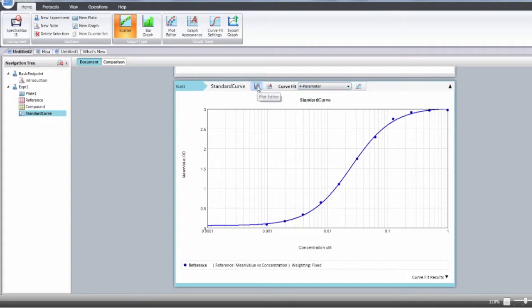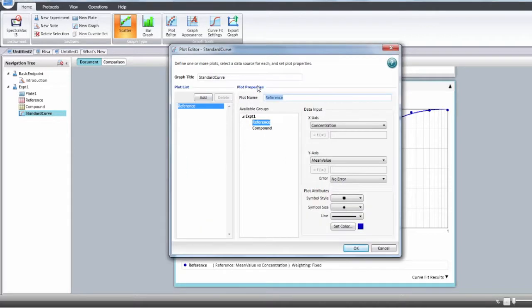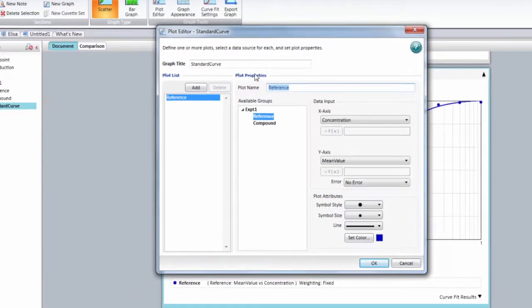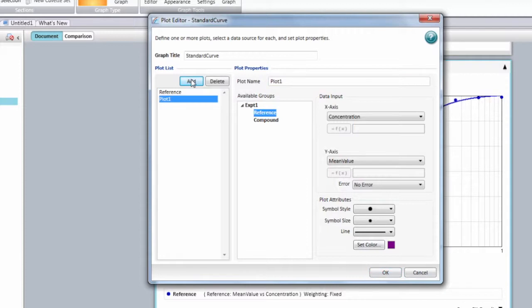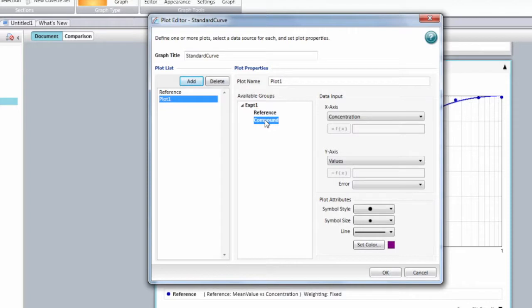Select the plot editor and the plot editor window will appear. Select Add. This is adding a new plot. You can then choose from one of the available groups from your protocol.